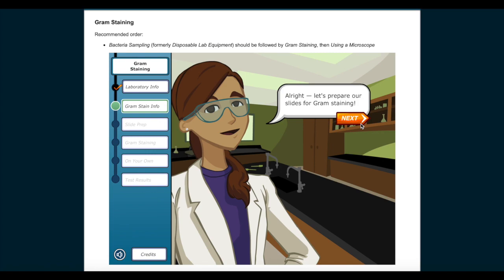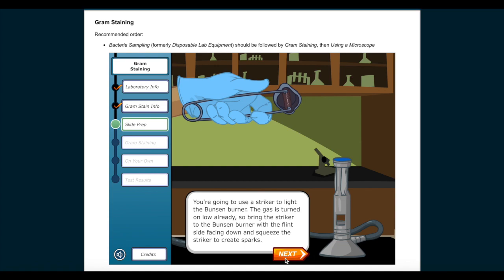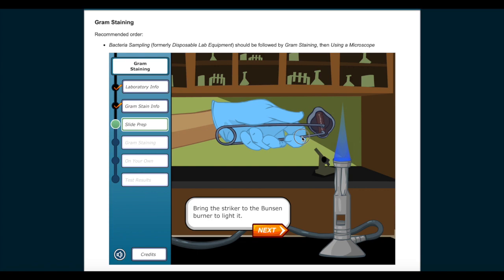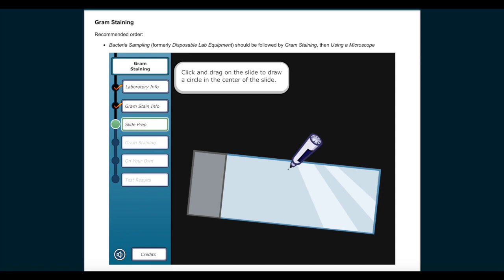We are going to Gram stain samples of the yogurt so we can see what kinds of bacteria are present. Alright, let's prepare our slides for Gram staining. To prevent bacteria from contaminating our work area, we have wiped down the table with a 70% ethanol solution. We will also light a Bunsen burner to sterilize the inoculating loops we'll use later and help maintain a sterile working environment. You're going to use a striker to light the Bunsen burner. The gas is turned on low already, so bring the striker to the Bunsen burner with the flint side facing down and squeeze the striker to create sparks. Bring the striker to the burner to light it. Draw a circle on the slide with a permanent marker. This indicates where the small sample of yogurt will be placed. Turn the slide over so the markings are on its underside. Click and drag on the slide to draw a circle in the center of the slide.